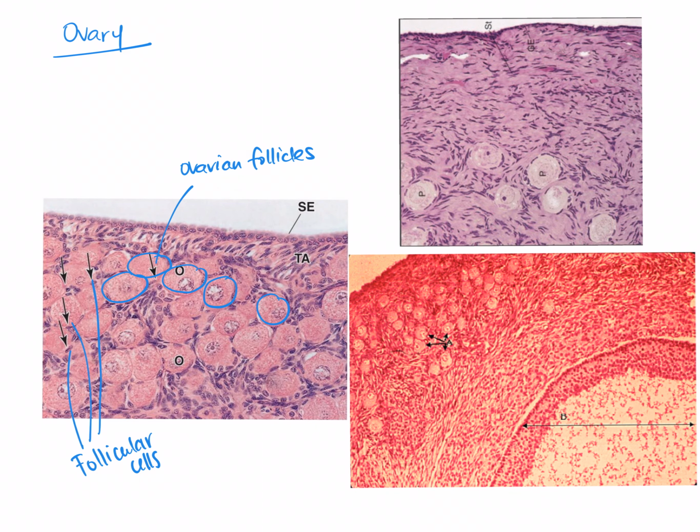With that in mind, looking at the two histological sections on the right, even though the staining appears to be different, especially with the bottom section here, which does not look like an H&E stain to me, the structural feature to look for is the aggregations of these follicles that clearly indicate that we're looking at the ovary as opposed to any other organ of the female reproductive system.